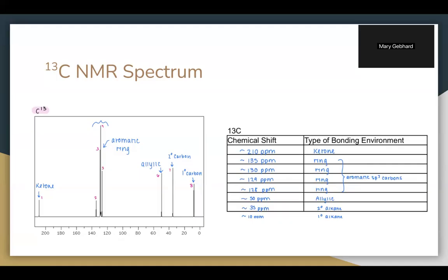And this makes sense considering that I have hypothesized that there is an aromatic ring present in my structure, meaning that the symmetry that occurs in an aromatic ring would cause the number of unique carbons to be different from the number of total carbons. So being that I had 10 total carbons, it's okay that I have 8 unique carbons due to the symmetry of the aromatic ring.